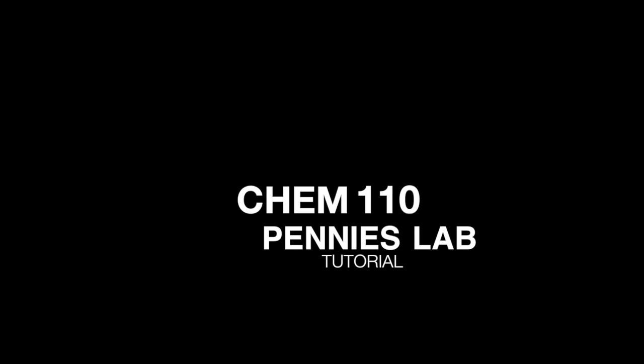This is a lab tutorial for the Chem 110 Pennies Lab, so we'll just be going through a quick introduction to the lab procedure.